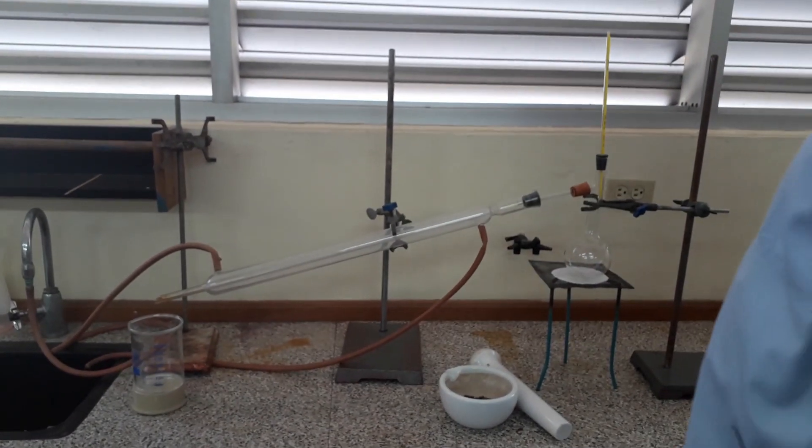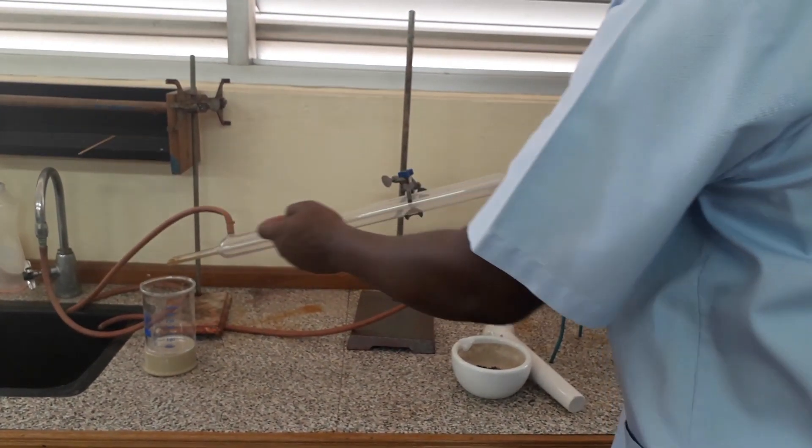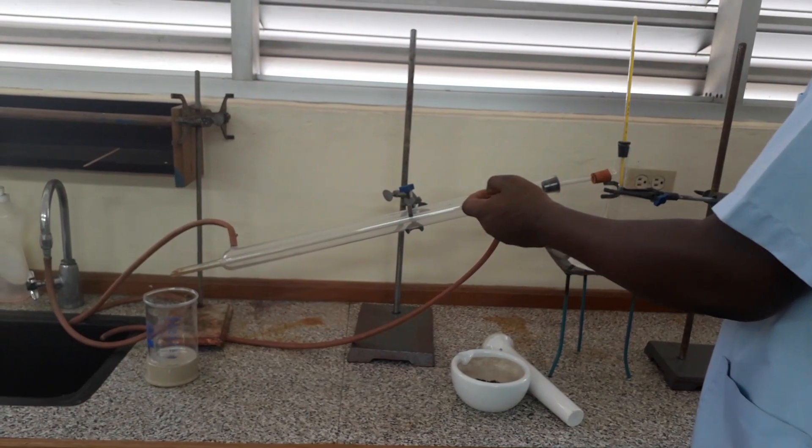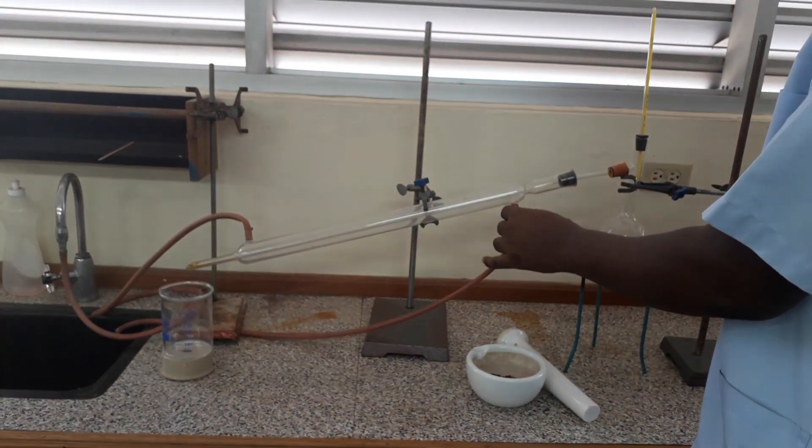Now, in the condenser, you're going to have water coming in at the bottom and comes up in the outer tube and comes out. So, cool water comes in at the bottom, hot water comes out at the top.